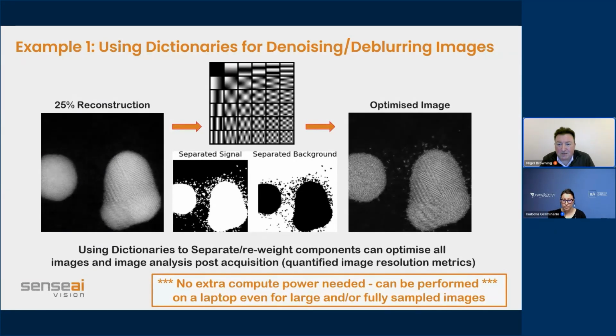Effectively, you can think about it as just doing a denoising effect on your TEM image. And so you're using the in-painting to denoise your TEM image under extremely low dose conditions. But the reason it works is because under extremely low dose conditions, only 20-30% of the pixels in your TEM camera have any scattering in them. And so it's a subsampled image, and so it will work in the same way.